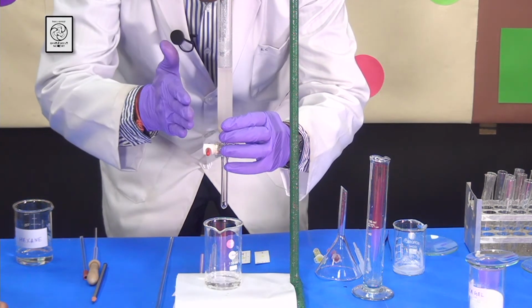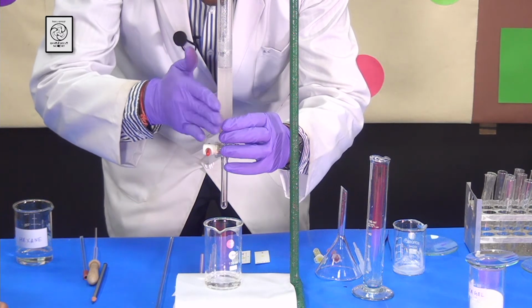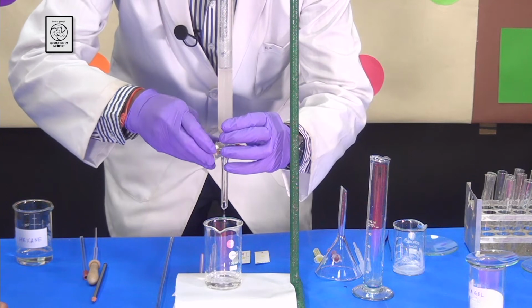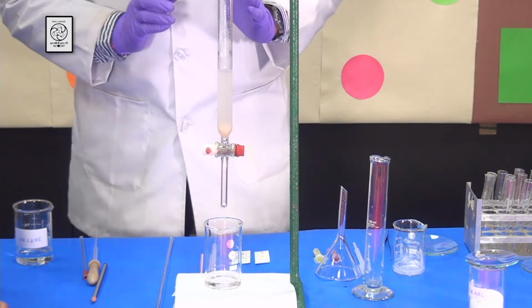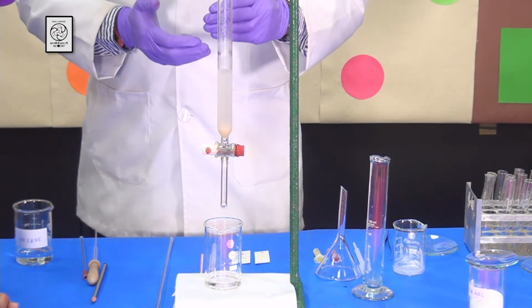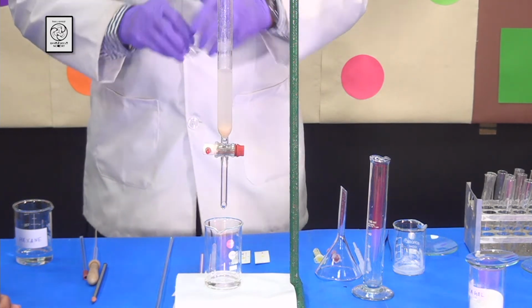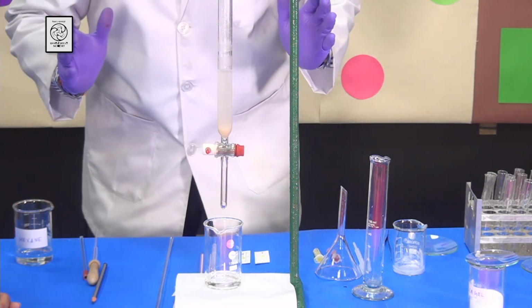Then one last time you can tap it nicely and make sure that the silica gel is packed very nicely. You can repeat this 3 to 4 times so that the silica gel can be packed properly. Now close the stopcock and let's do the experiment.